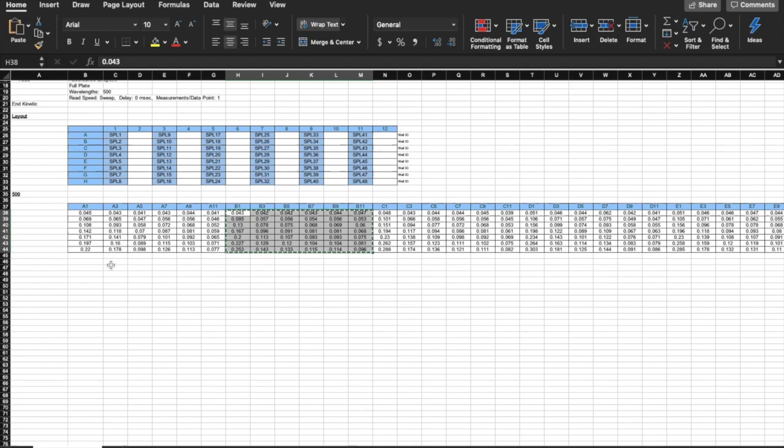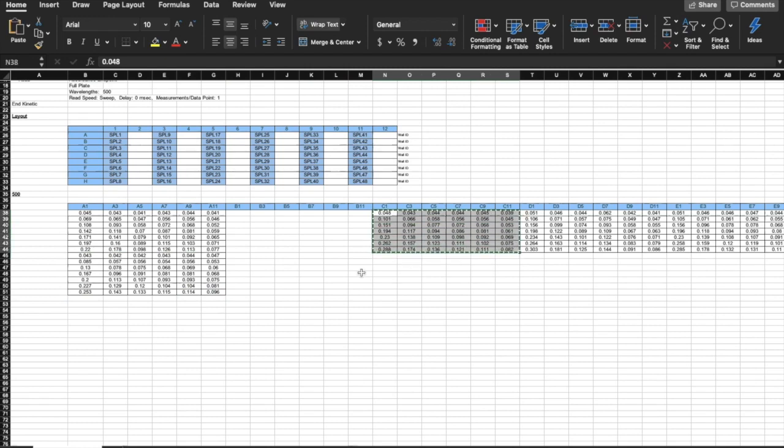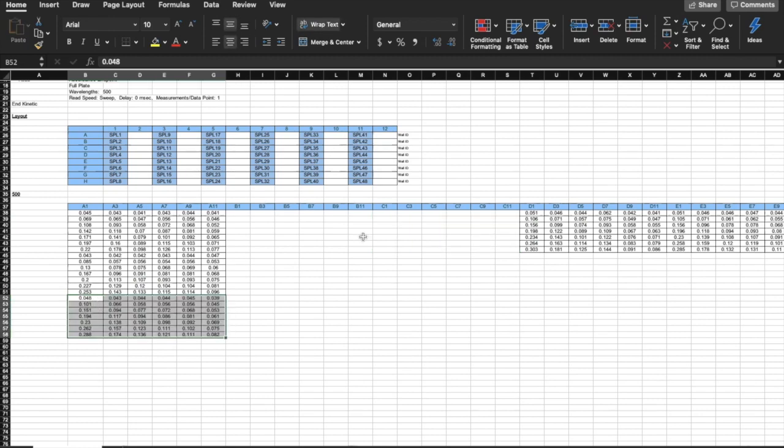Open up the Excel file. You will copy and paste B1 to B11 under A1 to A11. Repeat this step for B through H.